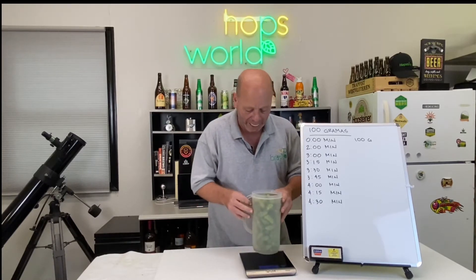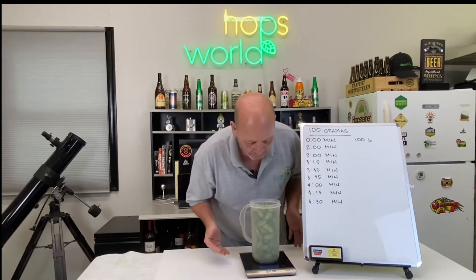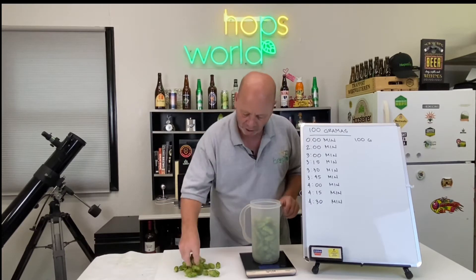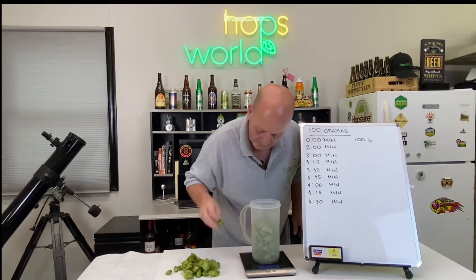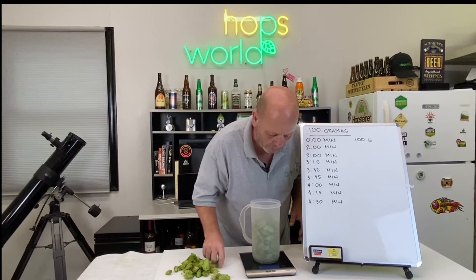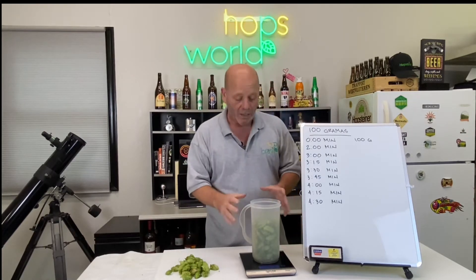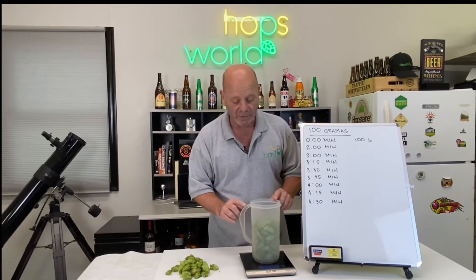With the container at 150 grams, the total with the cones needs to be 250 grams. We're at 276, so we take out a handful of cones. Right at 250 — actually 248, then 250 right there. That means we have exactly 100 grams of cones, since the container weighs 150.